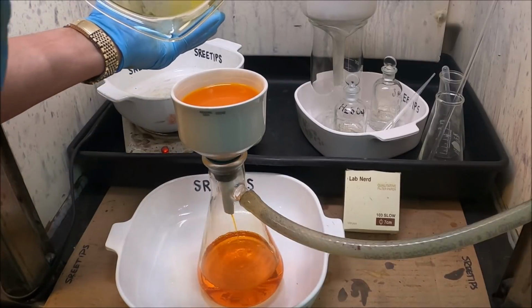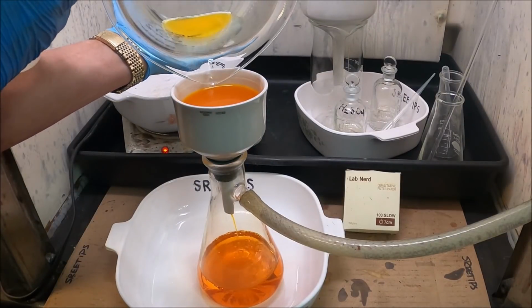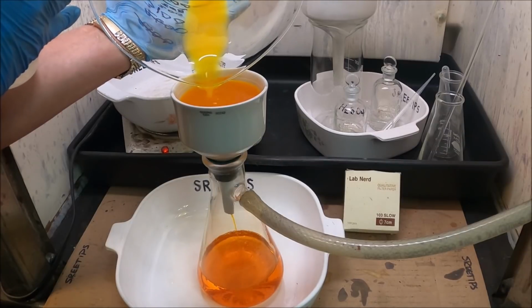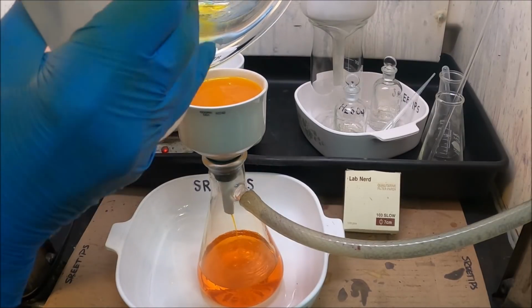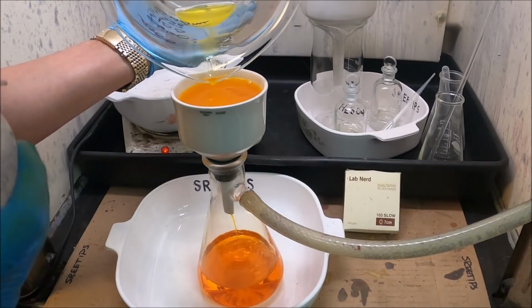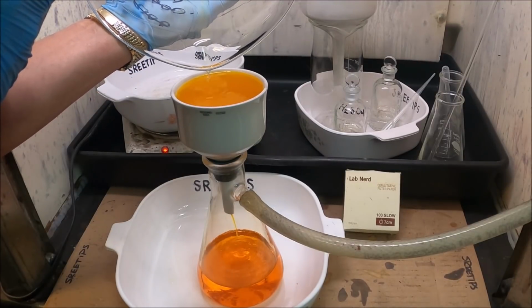Most of the solid material on the bottom of the beaker is the filter paper that disintegrated. There's a couple of pieces of undissolved gold down in the bottom of the beaker, and that's okay. I'm not going to go after those. I'd rather see that and know for sure that I will not have to deal with any excess nitric in my gold solution.